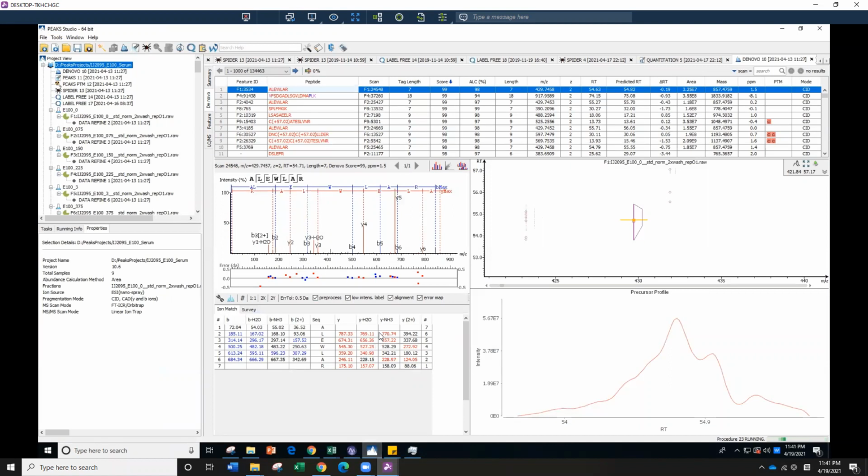From there, we have each piece, and we can calculate the mass of the Y ions and B ions, and we can calculate the differences between each piece. Because protein is made of peptides, and peptides are made of amino acids, and we only have 20 common amino acids, the delta mass between each ion peak should be fixed.